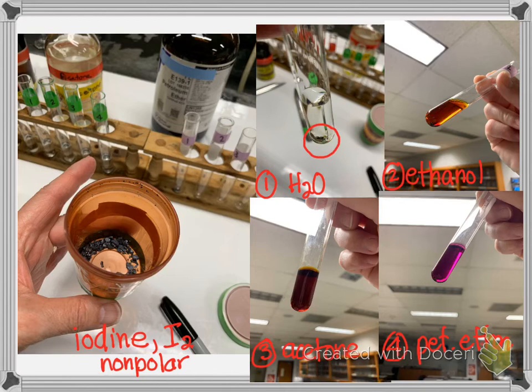Notice the water really didn't change any color. It still is colorless. But in the ethanol, the acetone, and the petroleum ether, there was no solid left in those test tubes. And I tried to shine light on it so you could see it a little better, but the colors are so dark it was hard to see. But I will tell you there is no solid left in ethanol, acetone, or petroleum ether. The water is the only one that was insoluble that had some solid left. And you can see even the color of the water remains colorless, while the other ones all changed color.